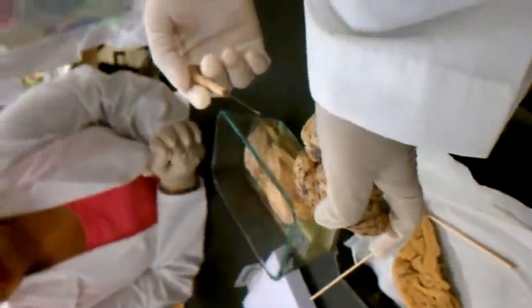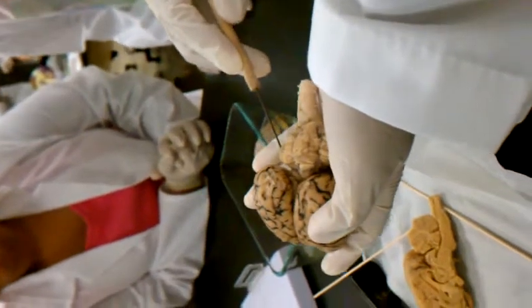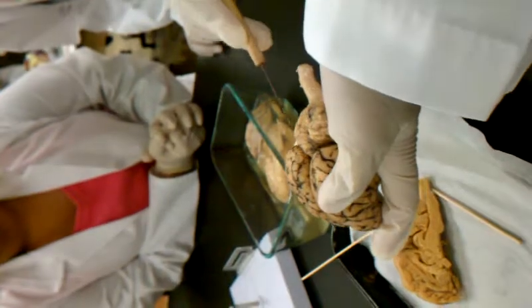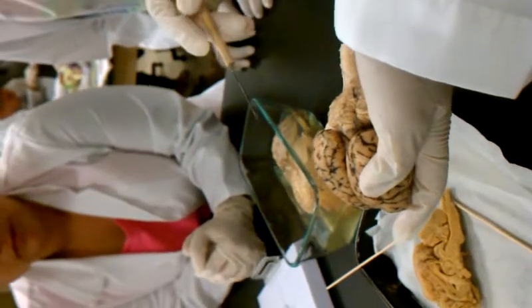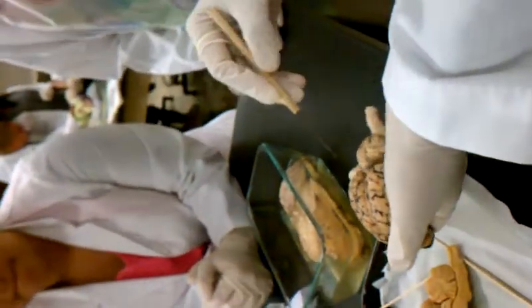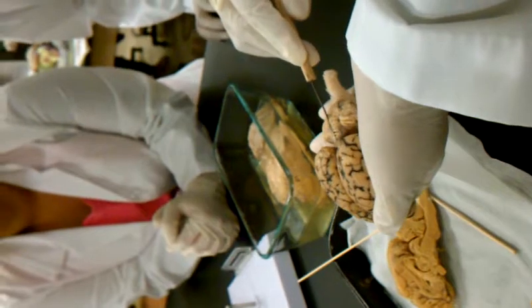The lateral hemisphere. You have right and left hemisphere and something else in the middle separated by these two lines. So within each one you have the medial and lateral hemisphere. Okay. Vermis, you see these worms? Mm-hmm. Middle portion.